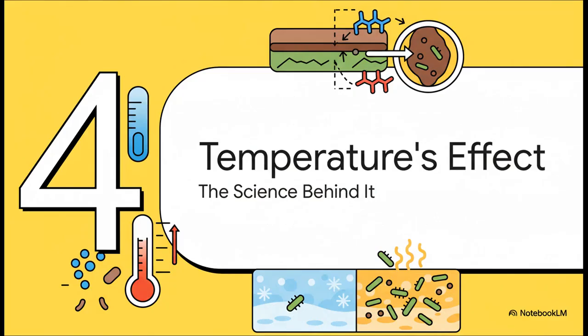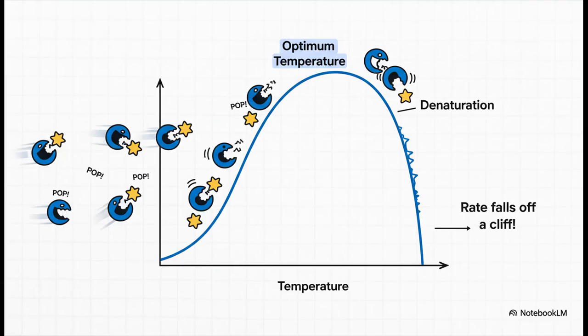So we've seen what happens. Now we need to understand why it happens. What's the science that explains our results? The secret ingredient here is enzymes. In this case, an enzyme called lipase is breaking down fats in the milk into fatty acids. More acids make the pH drop, and that's what makes our indicator change color.